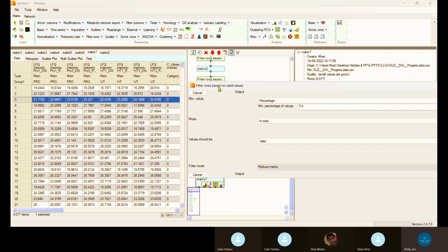With Dr. GC we are working on this. For this I basically take a hybrid approach. So if a sample is like 50-50, then we put 0 instead of putting any imputation value. Okay, so just a small value. Yeah, we put only 0 there. Okay.